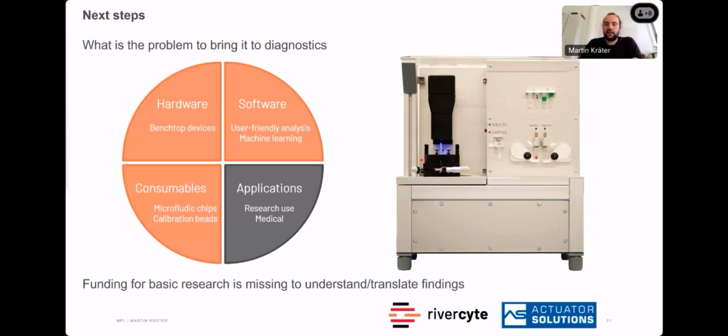Obviously, we need patient care and drastic patient care. But basic research also needs to come up in order to produce new technology, such as deformability cytometry, to make diagnostic approaches, and based on these diagnostic approaches, maybe subsequent treatments.